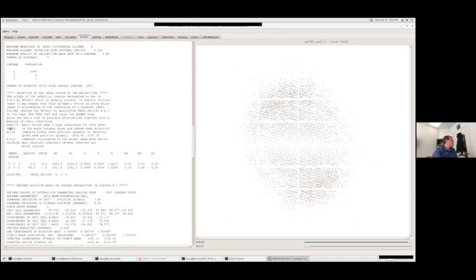All right. In this section, selection of the index origin, it gives us here XD, YD. This is the direct beam position that we put into the input file. Then it picks an origin based off of those and refines that.